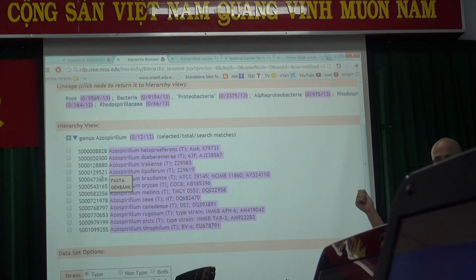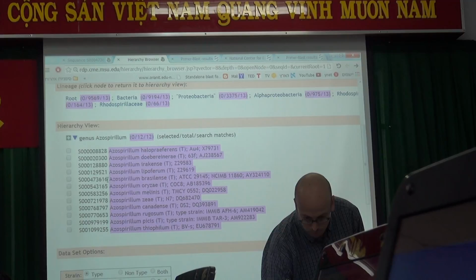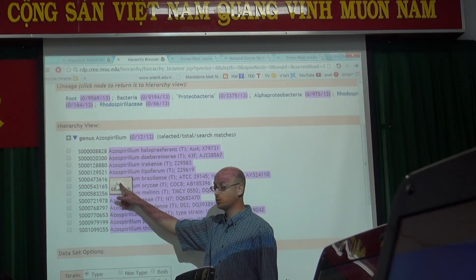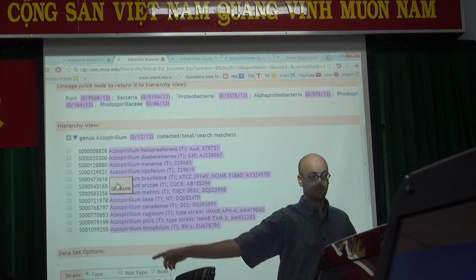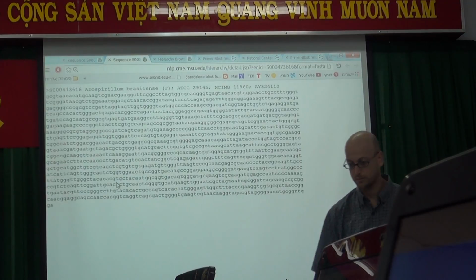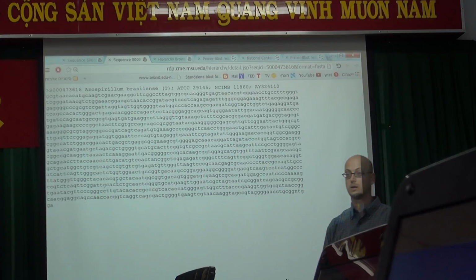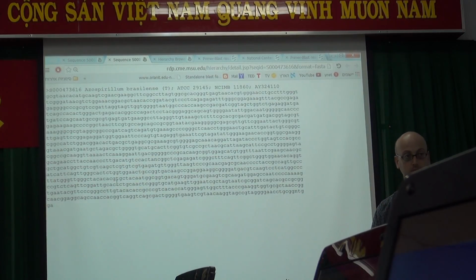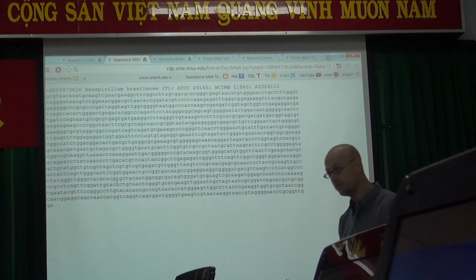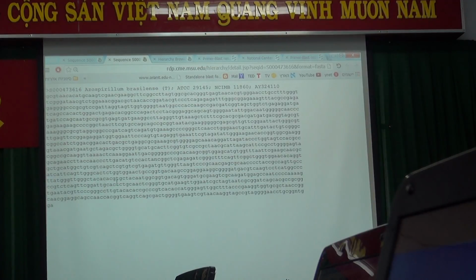Everybody see that? We choose FASTA. We choose FASTA. And we click. So the first step is complete. We have the 16S sequence of Azospirillum brasiliense.